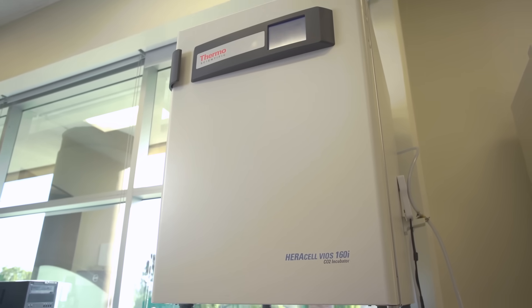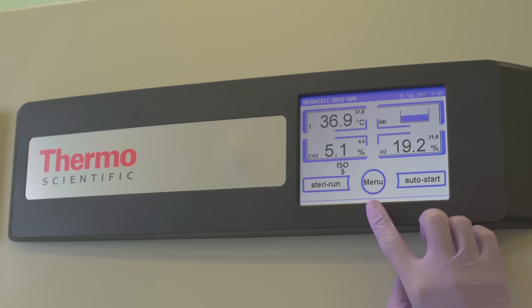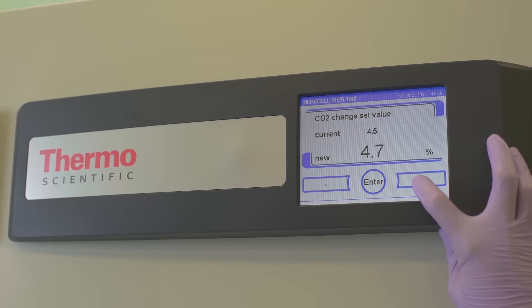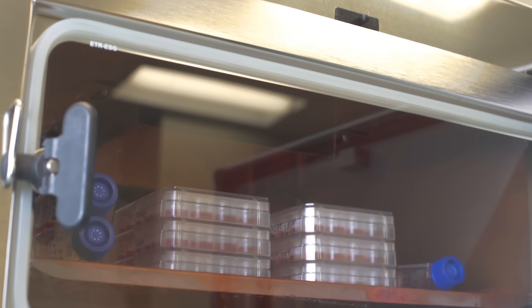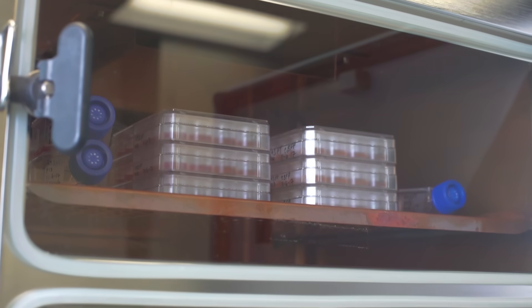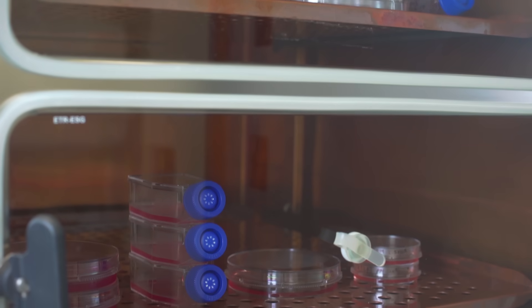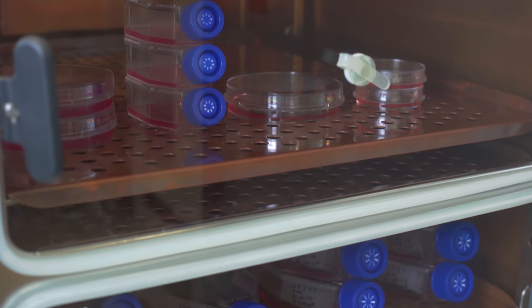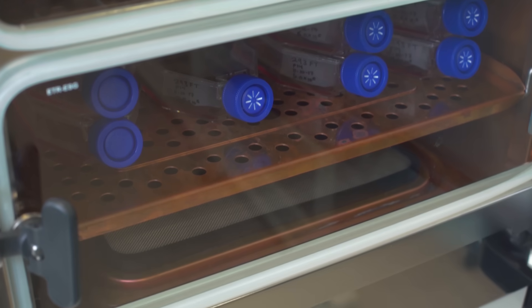Incubators provide the appropriate environment for cell growth. Carbon dioxide and temperature settings depend on cell type and medium selection. Mammalian cells are cultured at 37 degrees Celsius in the presence of 5-7% carbon dioxide with high humidity. Inside the incubator, keep your cell culture flasks evenly spaced and avoid crowding to ensure that the air inside the incubator moves freely. This helps to maintain temperature, humidity, and proper gas exchange. Don't make very tall stacks of plates — they may fall over, and lower ones may not get the appropriate gas exchange.